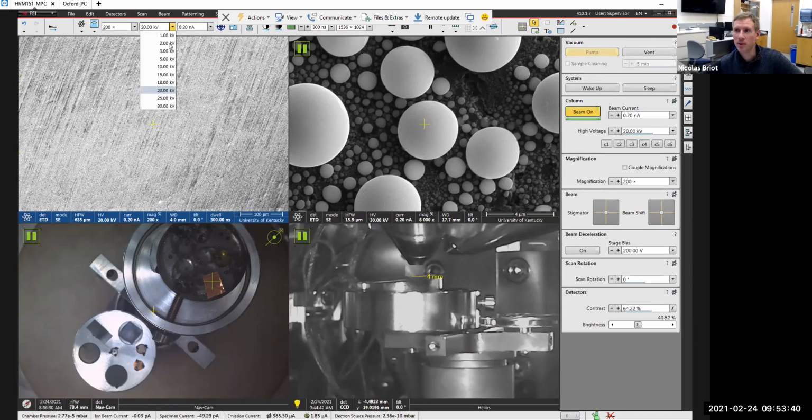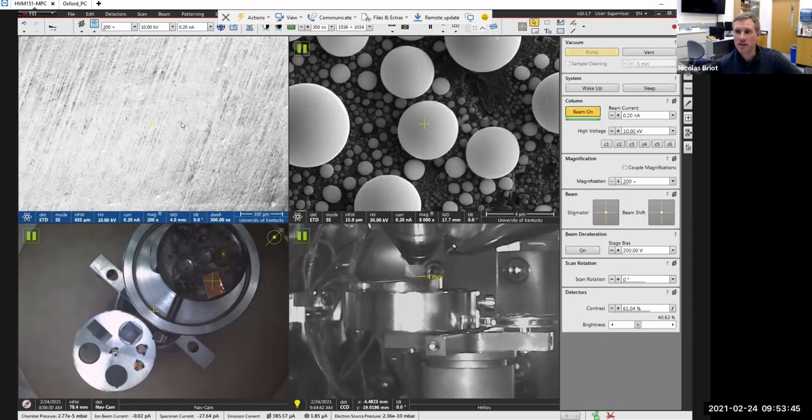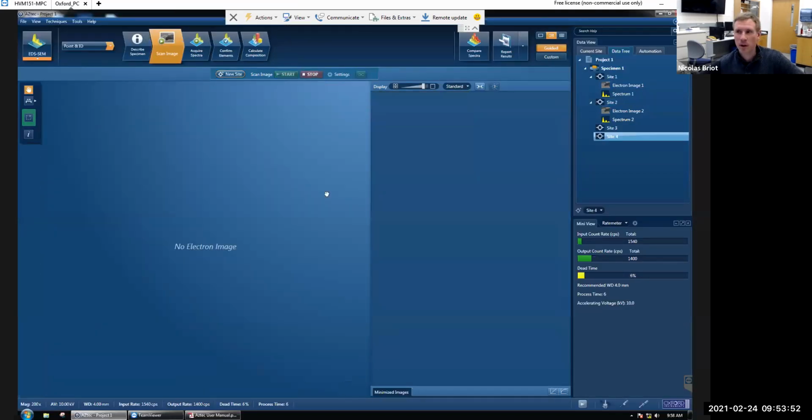All right. You could say, oh, I'm going to use 10 because my copper X-rays are at 8. Let's do the test. Acquire the image.